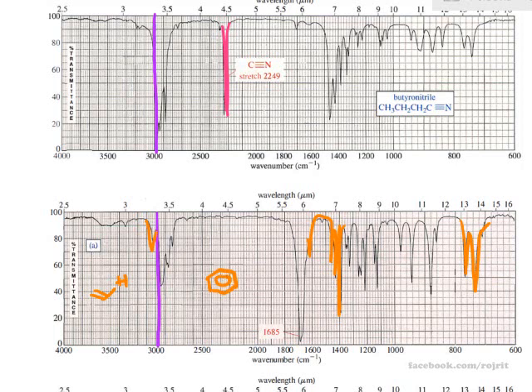But together with the benzene ring, you also have this strong absorption. Normally, the carbonyl appears at 1700, but this is slightly less than that, right? Indicating the weaker double bond. So what happened with this? This indicates that the carbonyl group is adjacent to the benzene ring.